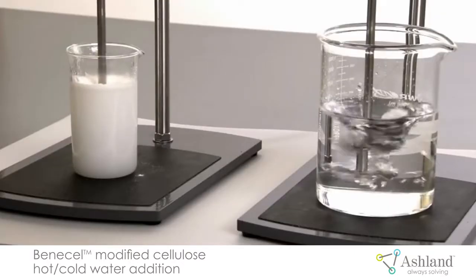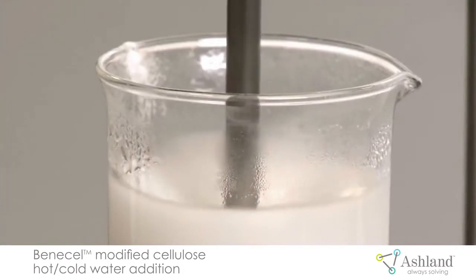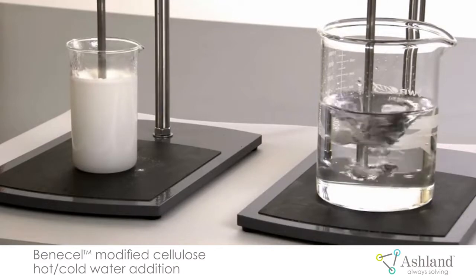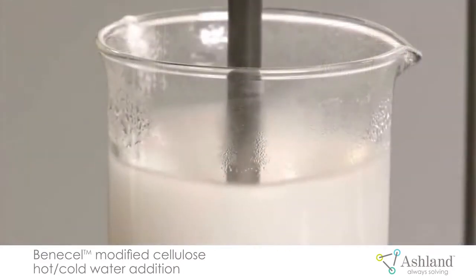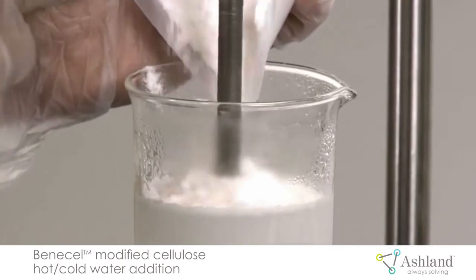To aid in the dispersion of Benecel Modified Cellulose and avoid lumps, you can add the powder using a hot-cold water method. As shown in this demonstration, the hot water acts as a dispersion aid before you cool the water down to the point where the water will hydrate.